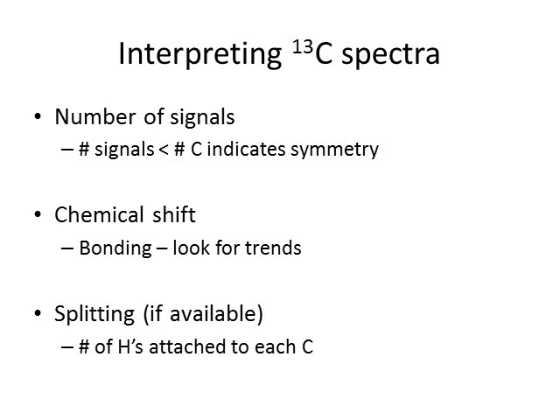Within the sp2 hybridized carbon region, sp2 hybridized carbons come, say, 100 to 200. But a carbon-carbon double bond versus a carbon-oxygen double bond will come at different regions. Carbon-carbon double bonds come more like 100 to 150, but a carbon-oxygen double bond can actually go as high as 210 or 220, but is more like closer to 200.